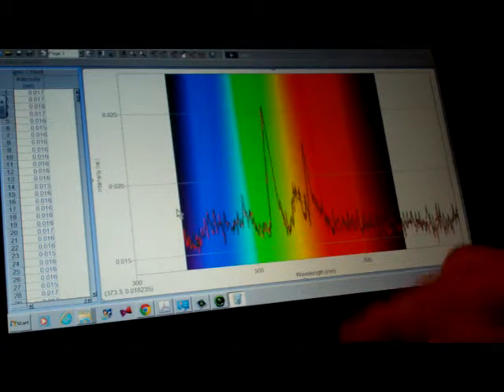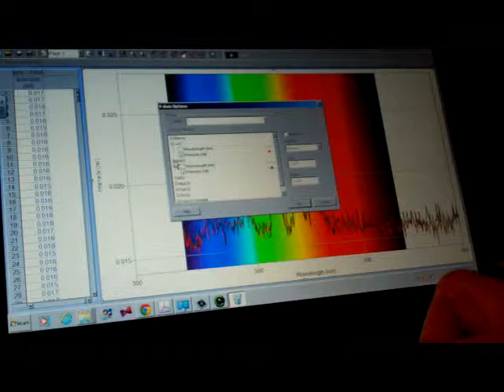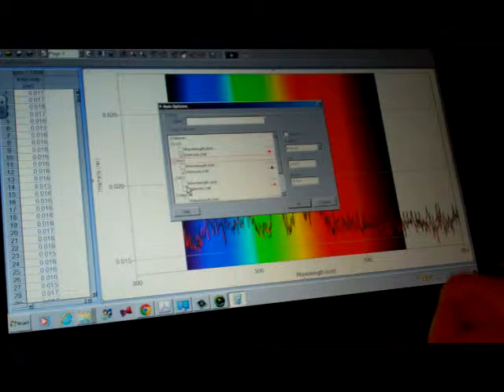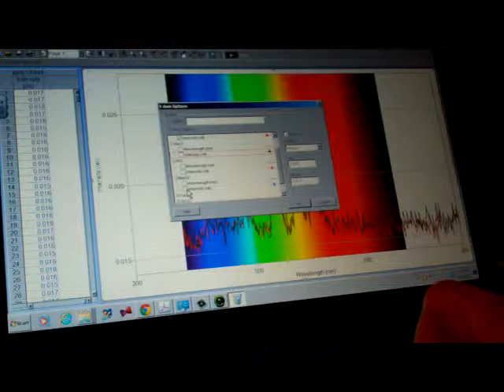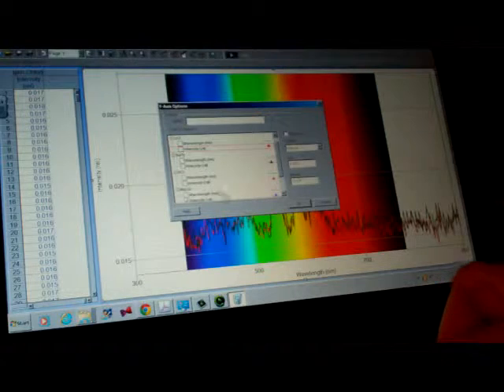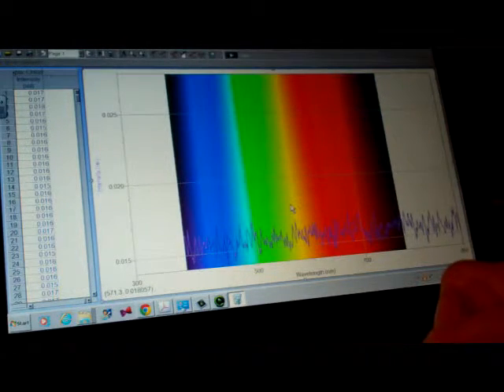And then we will get our numbers to record. Under intensity, under More, click off sodium chloride. Let's go to magnesium chloride. Just to show you how to make sure you scroll down, click on intensity. Like I said, make sure you have the others clicked off. And you can see there wasn't as much of a big peak for this one.